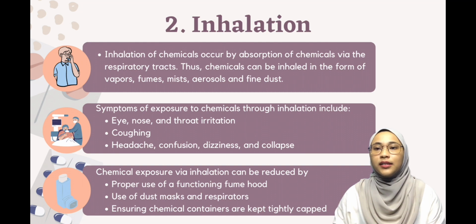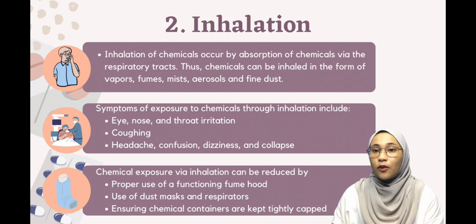Thus, these chemicals can be inhaled in the form of vapors, fumes, mist, aerosol, and also fine dust. As a result, overexposure symptoms may include headache, increased mucus production, and eye, nose, and throat irritation. Narcotic effects such as confusion, dizziness, or collapse may result from exposure to some chemical substances. If you notice any of these symptoms, get out of the area right away and obtain adequate ventilation.